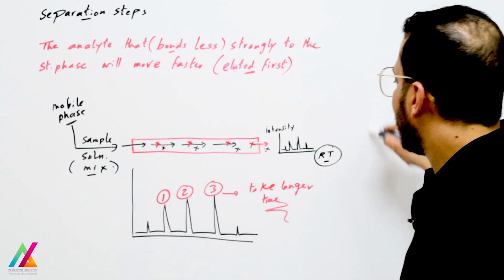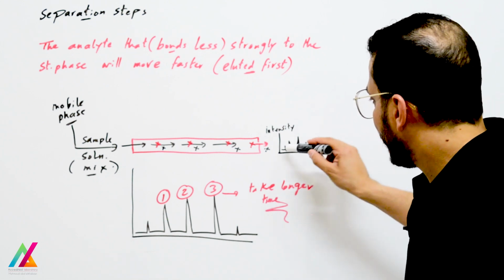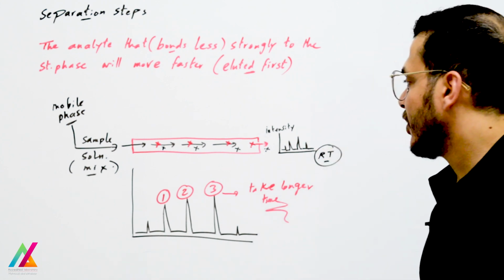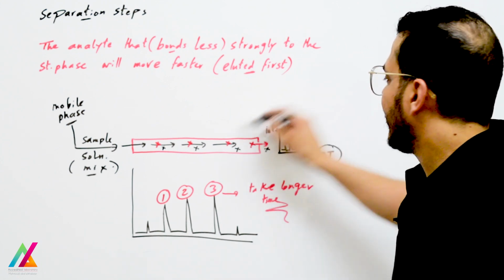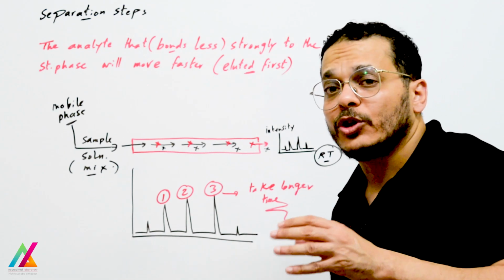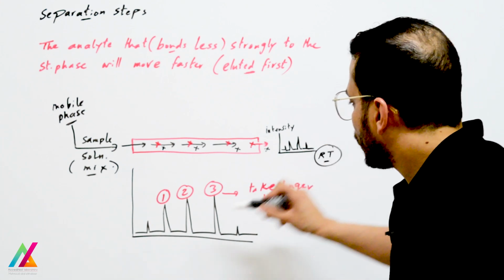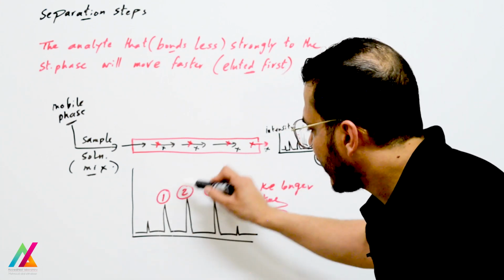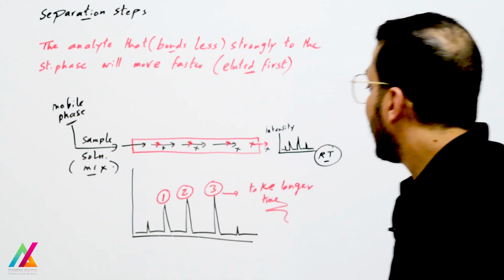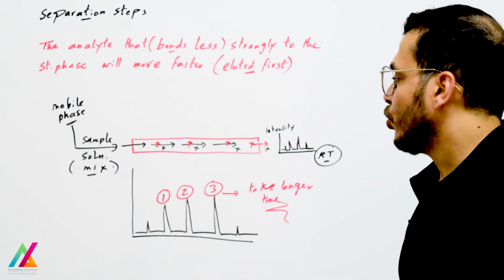And here in the chromatogram, you will find peaks eluted later and the peak eluted first at a specific retention time. Here is the relation between intensity and retention time for each compound, the time for the compound to be eluted. So this compound eluted first, after this is the second compound to be eluted, and then that compound takes longer time in the stationary phase to be eluted.